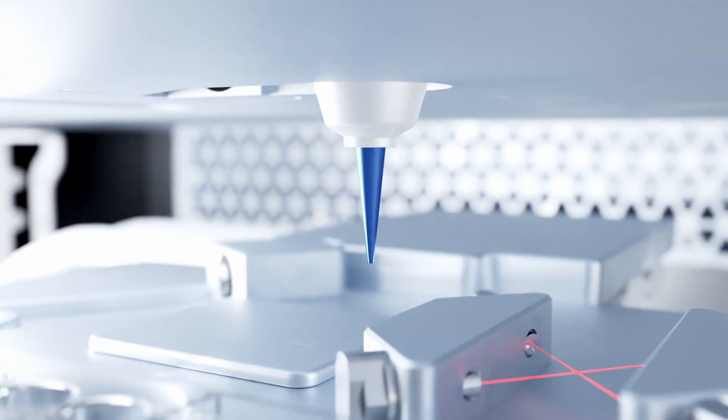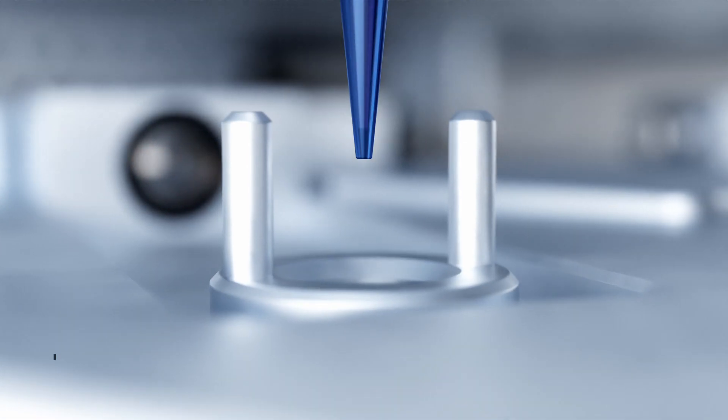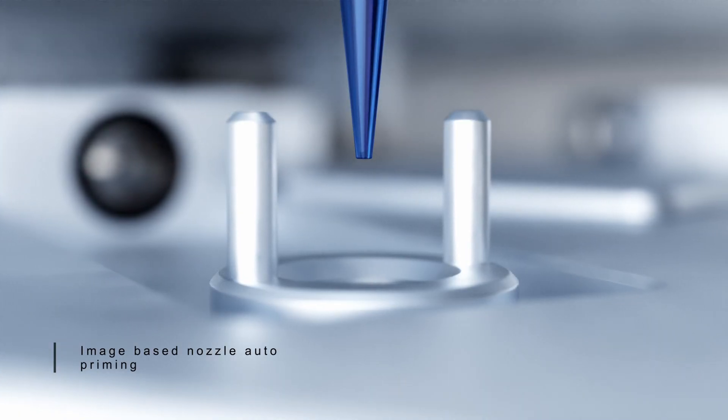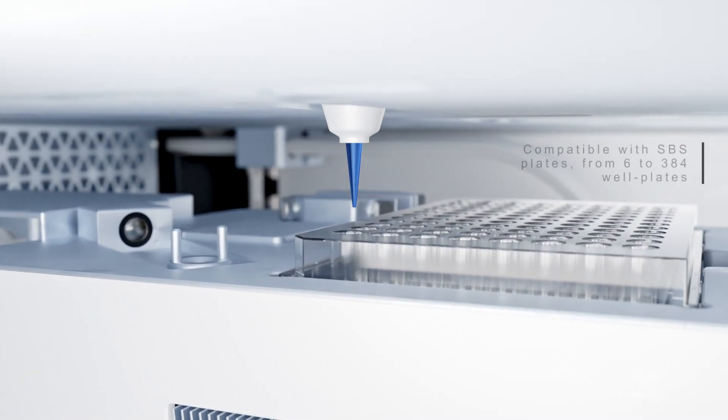Armed with nozzle auto-priming and a precise positive displacement extrusion mechanism, the BioCellX rapidly plates simple models in up to 384 well plates.